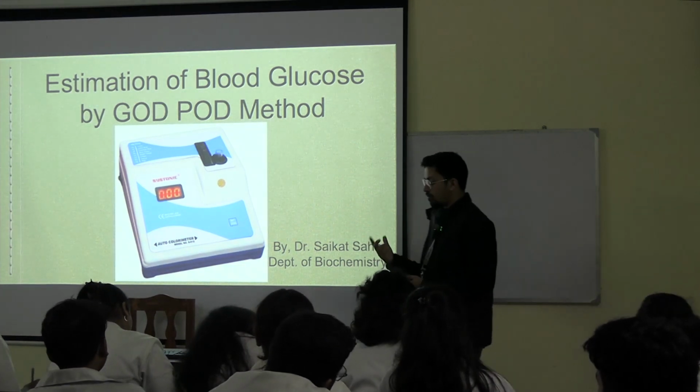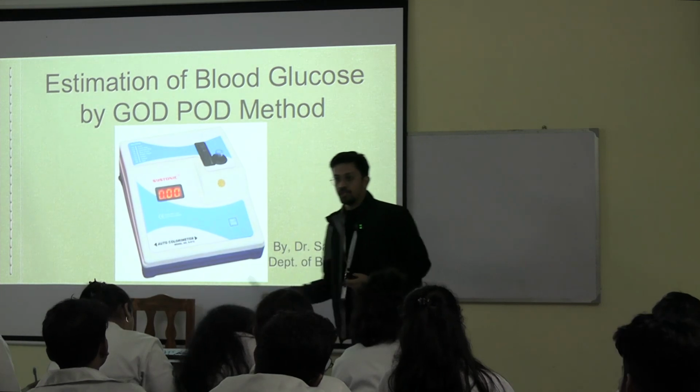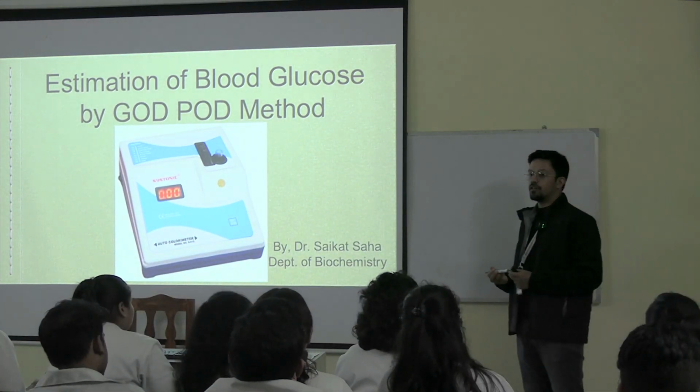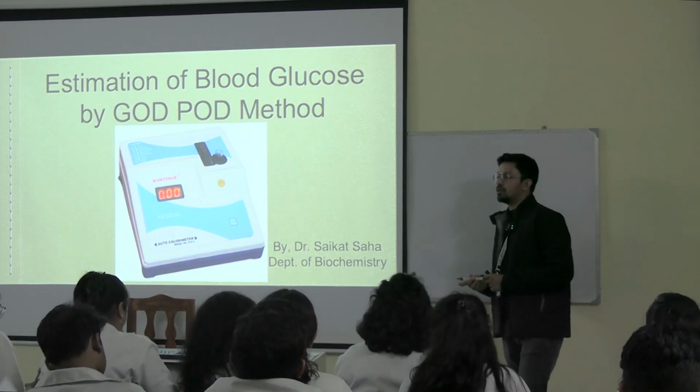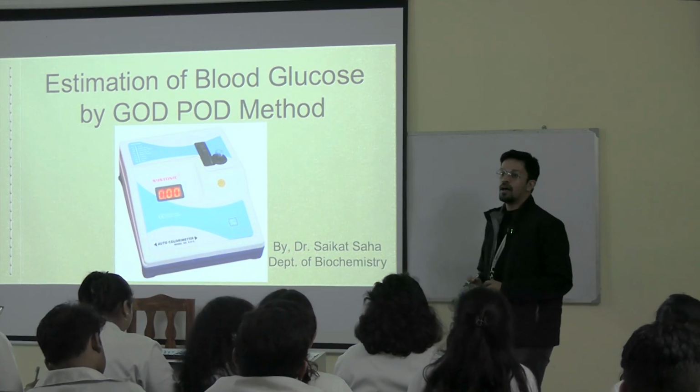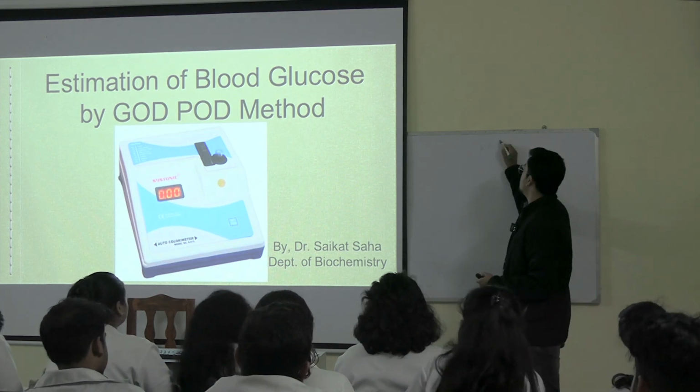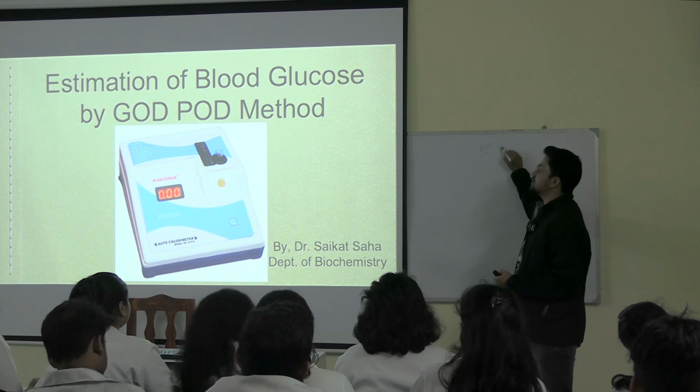What is the law on which it acts? Just now I said Beer's and Lambert's law. What is Beer's law? A is directly proportional to C, where A is the absorbance and C is the concentration.